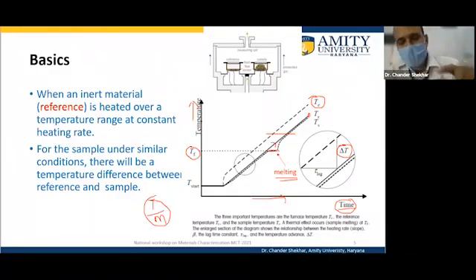If we follow the temperature of the sample, we can identify that at a particular temperature, the temperature of the sample was fixed at a particular point, and then it accelerated. It increased at a quicker speed. So at that particular time, there is a transformation.